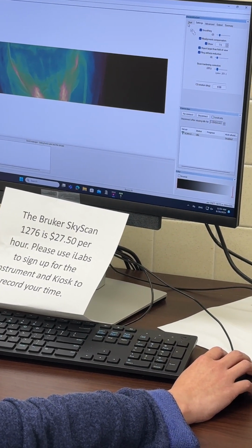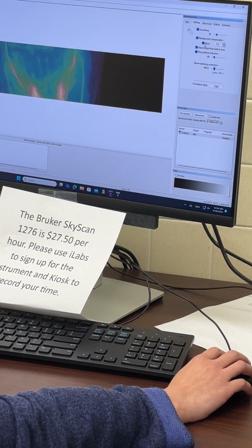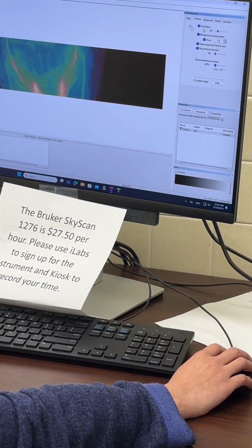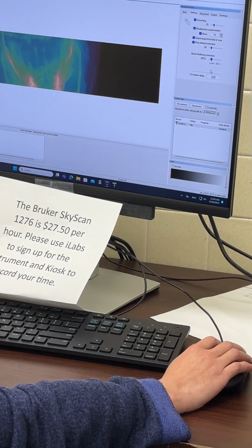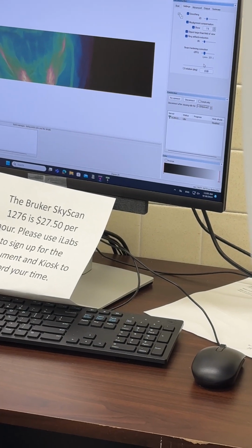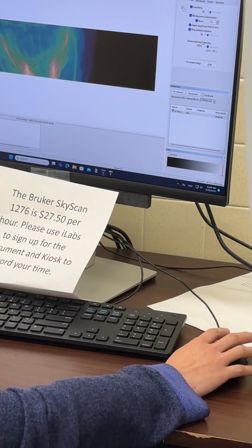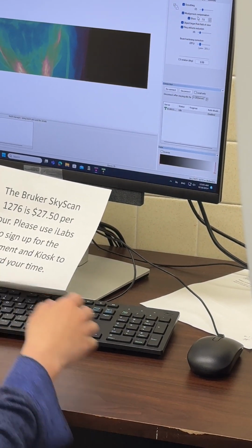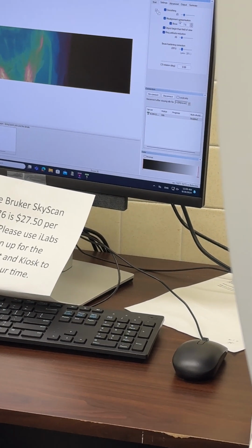Okay. The only thing you need to pay attention to is this one. Misalignment you need to adjust for every single sample by yourself. The other things, like ring artifacts, beam hardening, or whatever, you'd better keep consistent with the other samples. Like we already did this D3 project, so the other numbers should be the same, including your scanning setting; the reconstruction setting should be the same. Only misalignment is different for every single sample, so you need to adjust it. That's why I have the record for your sample.